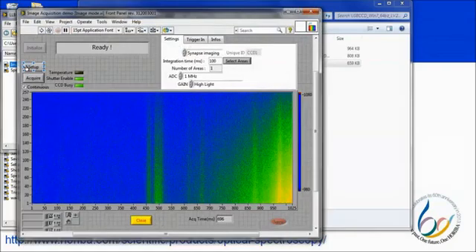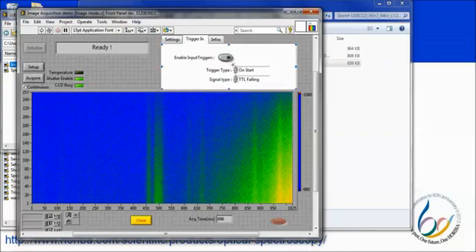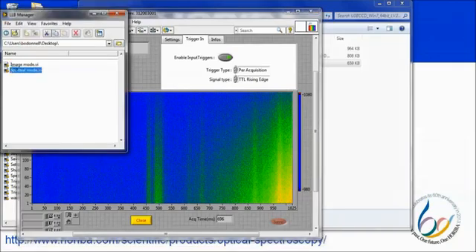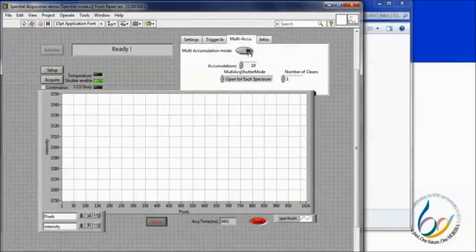If we look at the image mode VI, we see a settings tab where we select our CCD, set the integration time, the number of desired areas, the ADC rate, and the gain. There is an additional tab for enabling input triggers and setting the trigger parameters. Clicking setup sends the parameters to the camera and clicking acquire begins the acquisition. Spectral mode looks very similar, but in this case there is an additional tab for setting up multiple accumulations.